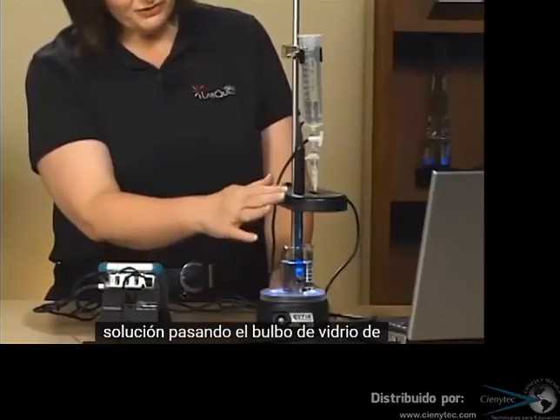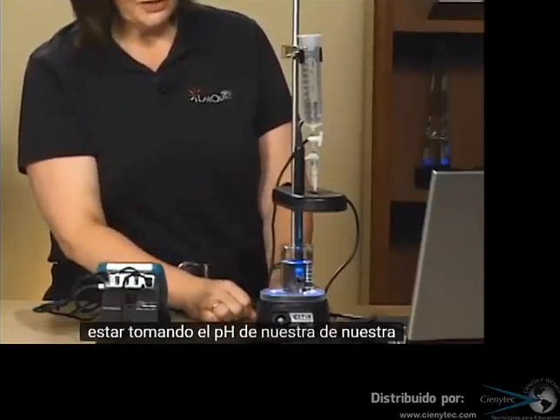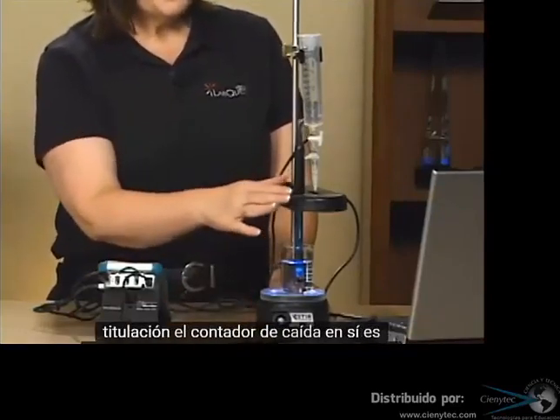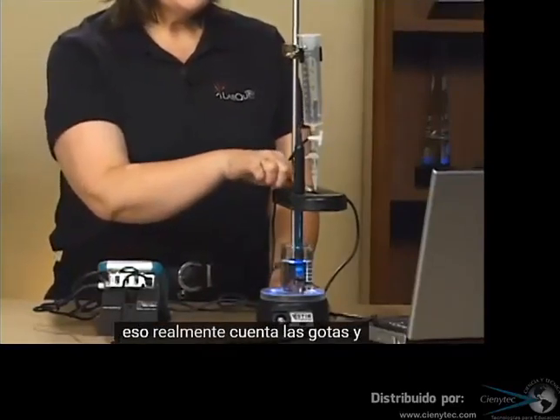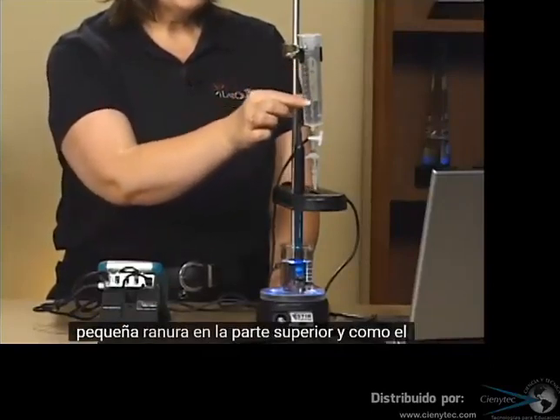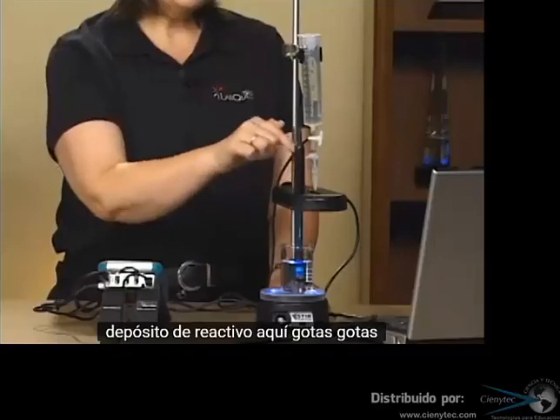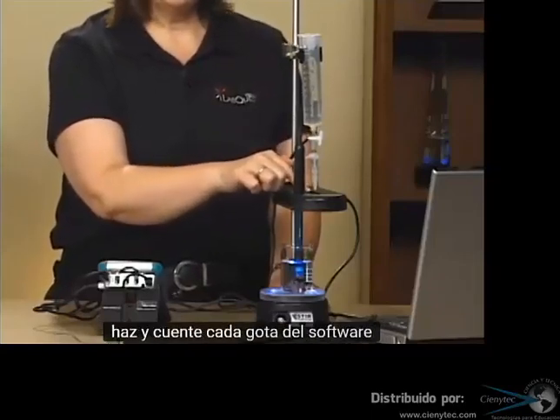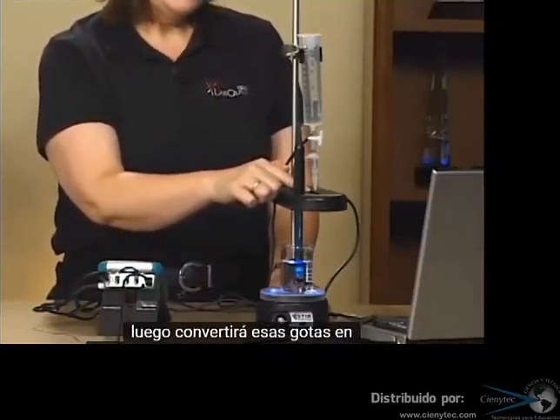This blue pH sensor going through the drop counter is what's going to be taking the pH of our titration. The drop counter itself is made of 2 pieces. This part is the part that actually counts the drops. An infrared beam of light goes through this little slot on the top, and as the reagent reservoir here drops through the slot, they will break the beam and count each drop. The software will then convert those drops into volume in milliliters.